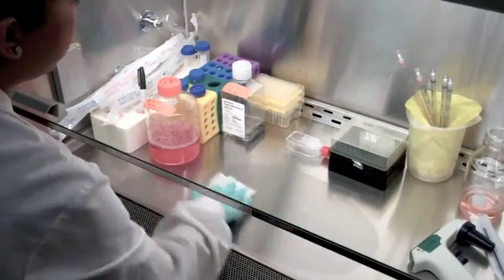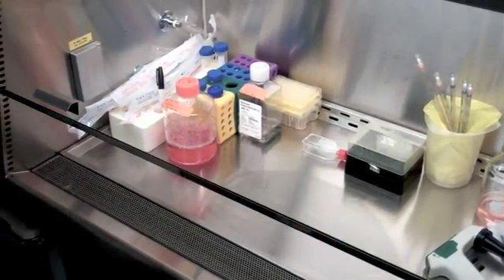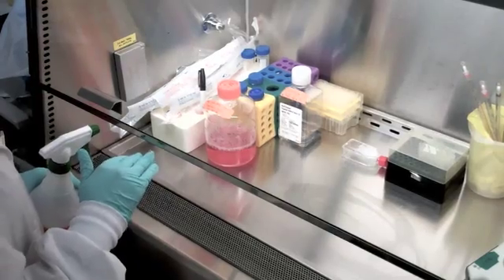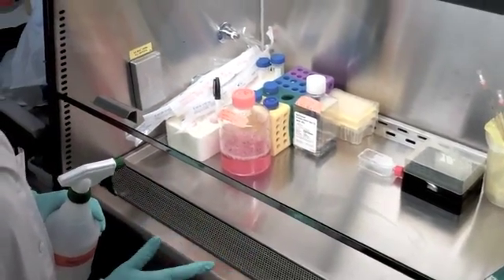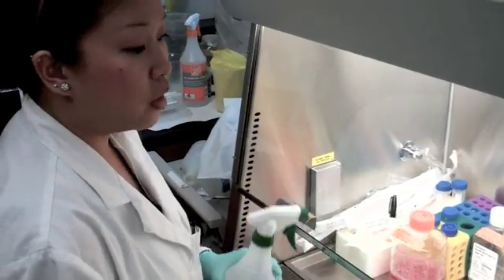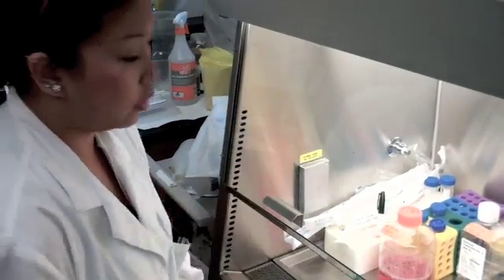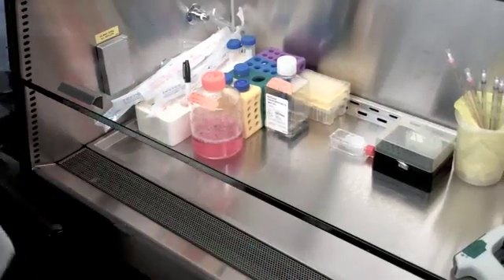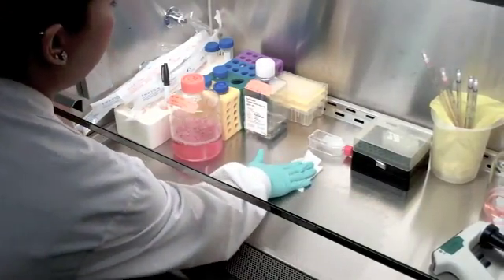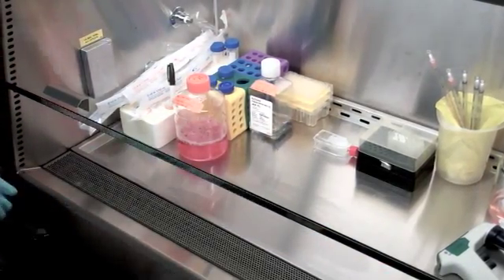You want to clean this with soap and water first. Why? Because if you spray ethanol straight into the media, it's going to react with it and the protein is going to basically leave a mark on the station. It's really hard to clean and it really is not as sterile, and then anything you work on later or the next person will be contaminated. So after you're done with that, you spray it with 70% ethanol on that area, and again you want to wipe it with a chem wipe, making sure to go from the top to the bottom.